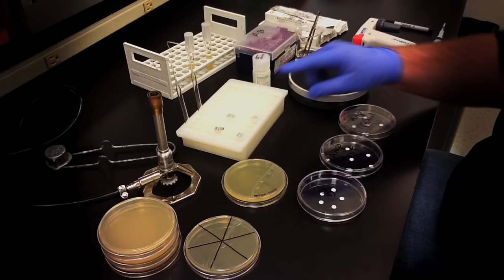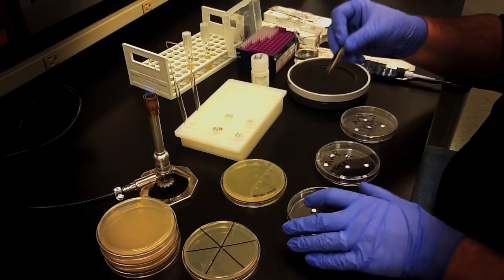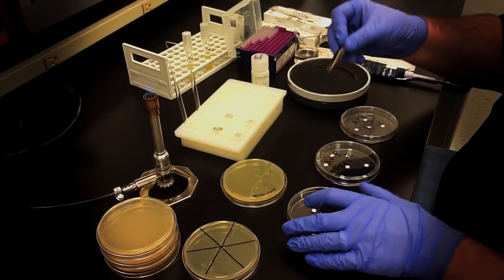Making sure to keep everything as sterile as possible, add a few 6 millimeter filter paper discs to a petri dish. I always add a few in case I drop one. Next, add 20 microliters of ampicillin solution to each disc.